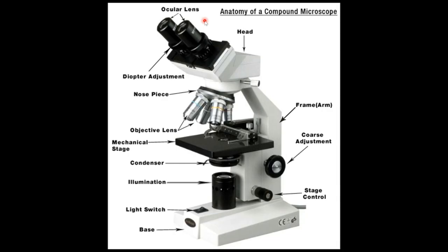Sure, you might want to zoom in on some things. If we were doing this in the lab, we would be looking at slides of blood, some cells like I just showed you in the previous slide, and sperm, because everybody will look at blood and sperm. I try to figure out what I can get people to look at. And blood cells and sperm cells are very, very small.